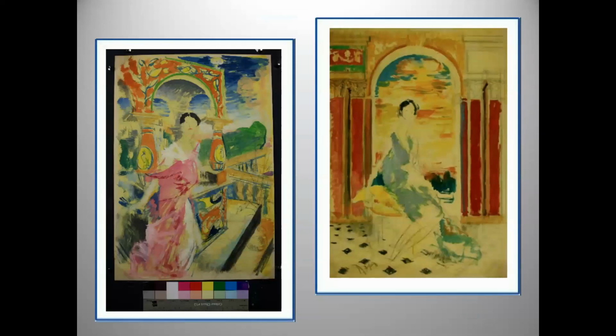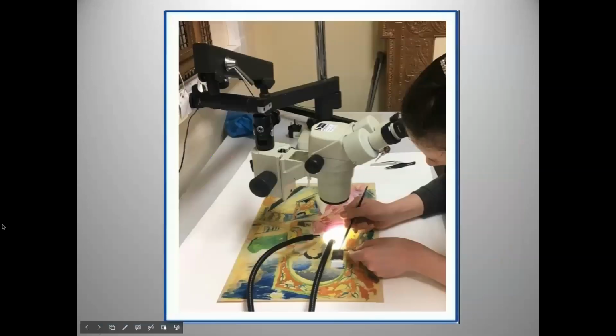The slide now shows 2 of Sim's paintings of Lady Rock Savage on paper and card. One of the difficulties faced when undergoing organic analysis is the possibility of foreign substances or contamination products affecting the end results. Among these dangers are pigment interference, detection limits, the migration of mobile chemical markers, such as fatty acids, and the formation of degradation products.